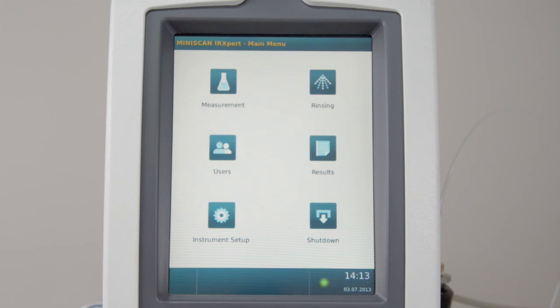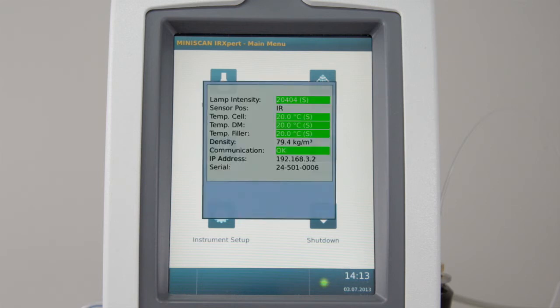By clicking on the status indicator at the bottom of the screen, you can always check the analyzer status. Here, you will find information about lamp intensity, sensor position, temperatures, and communication.